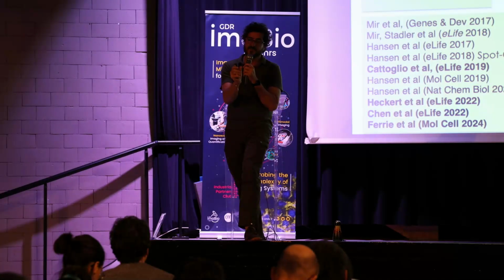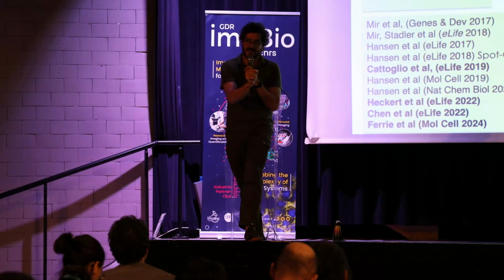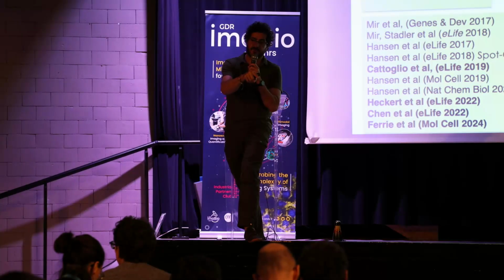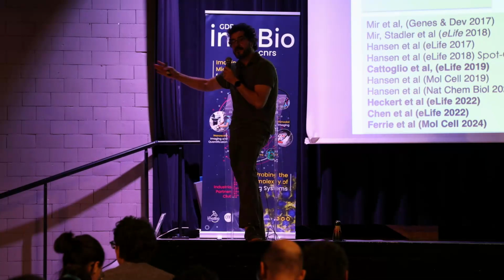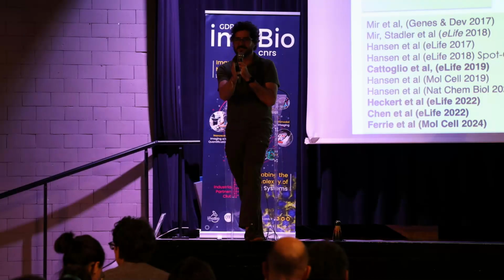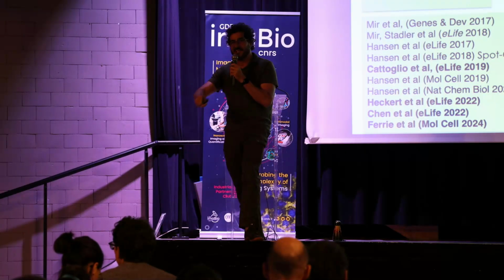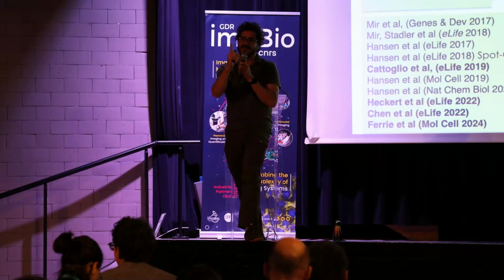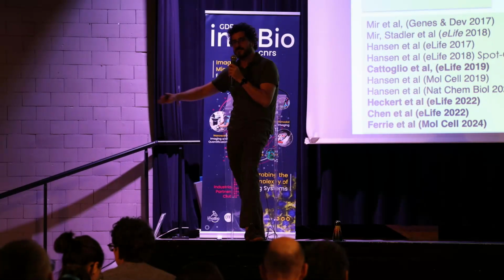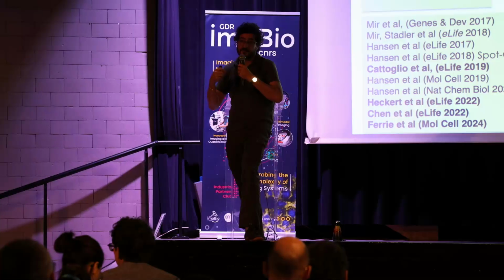So I am not measuring an interaction every time I see the molecule. I don't know if this molecule is still interacting. What I'm telling you is at the time I send the laser pulse to photoconvert, this molecule was in proximity to a green dye. And now I am following the life of this molecule, which is great because I can measure decays, right? I know they were interacting at time 0, and now I can see how they change their dynamic. And now I know, because I have identified my peaks of diffusion, I know which one is who, and I see how this curve of diffusion coefficients is changing over time as a function of dissociation, for example, of this complex.